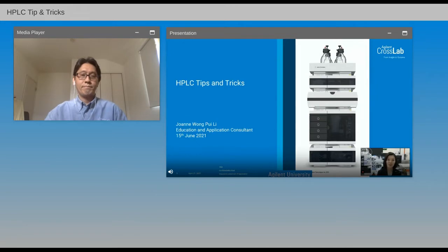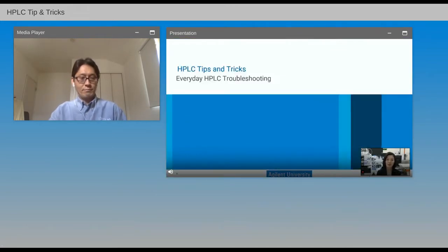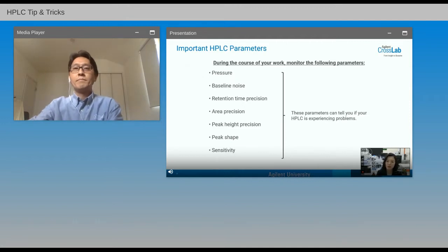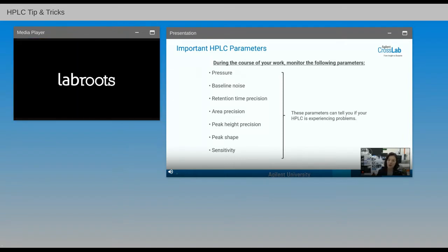Hello, everyone. Today, I'm going to share with you some of the HPLC tips and tricks in this webinar. The objective of today's session is to give you some ideas about everyday HPLC troubleshooting. I believe that some of you who have been using HPLC already have an idea of what may need to take note. But for today's sharing, I want to start with why it is important to know your baseline operating parameters. If changes occur, it will make it easier to troubleshoot.